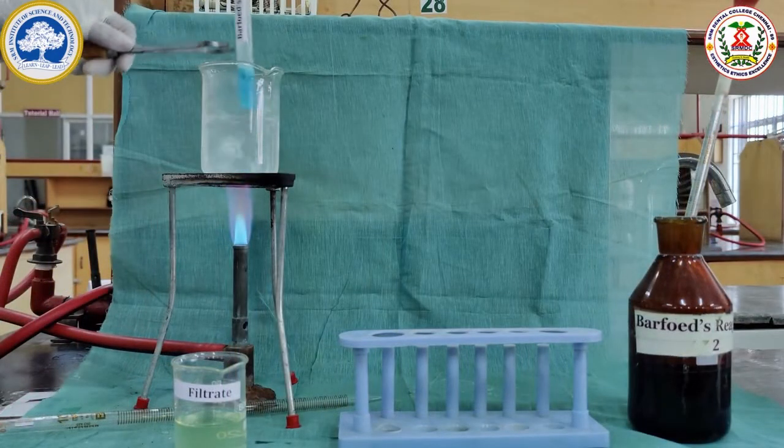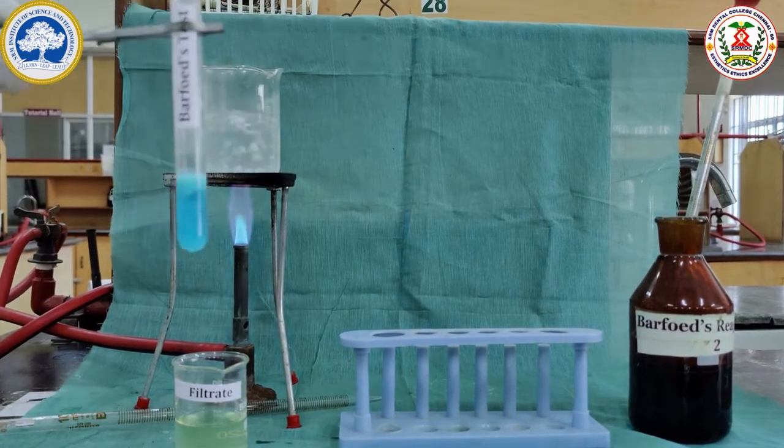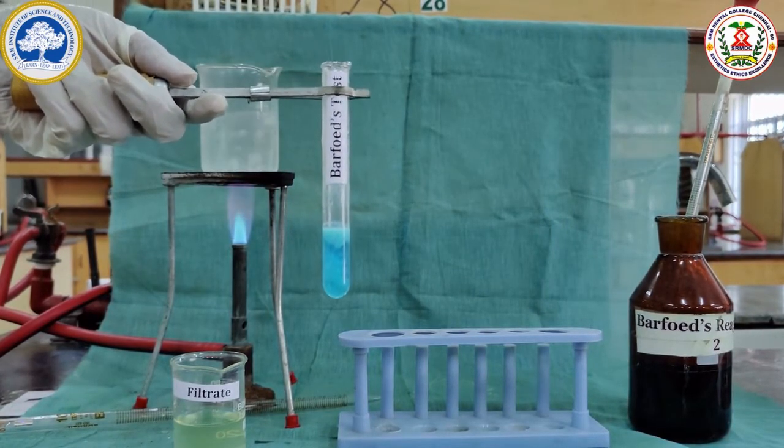After 2 minutes, we can see there is no color change in the Barfoed's reagent. This shows that it contains the disaccharide. Lactose is a disaccharide.